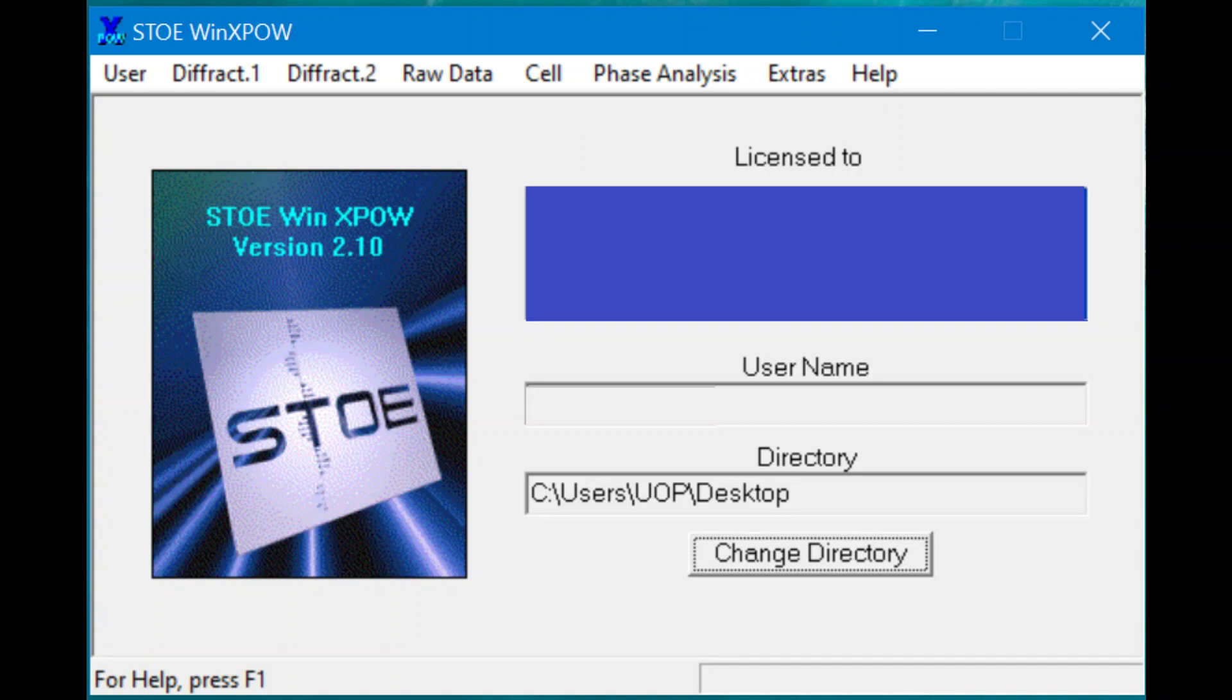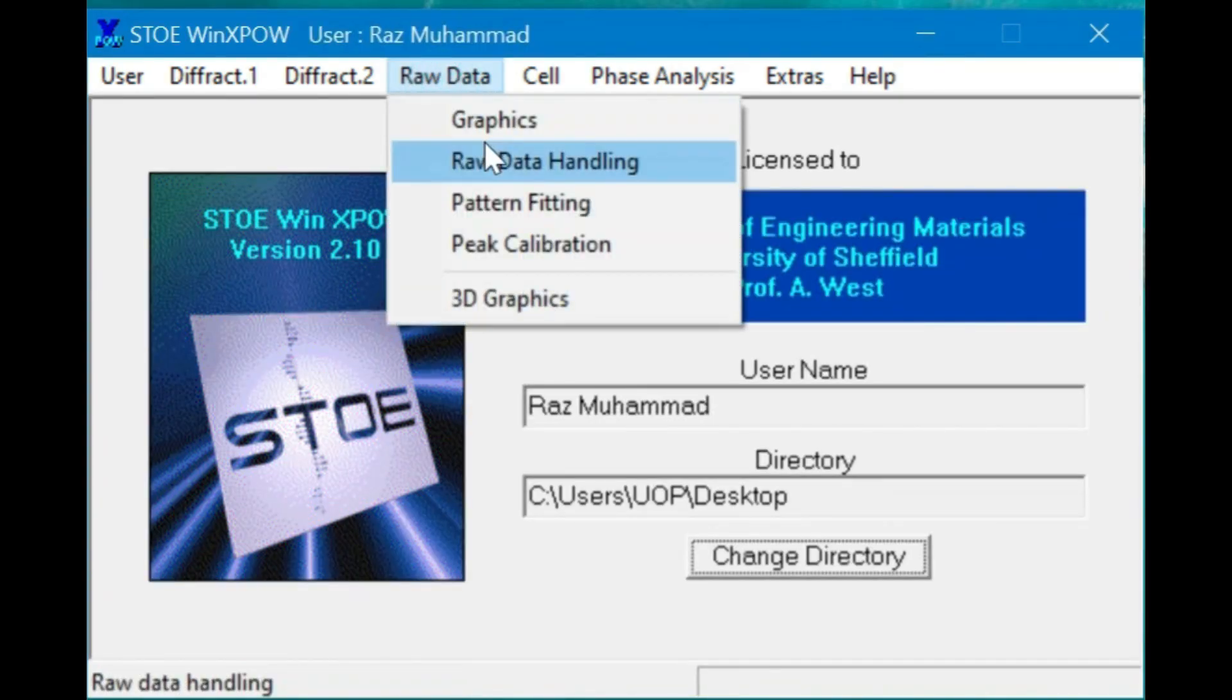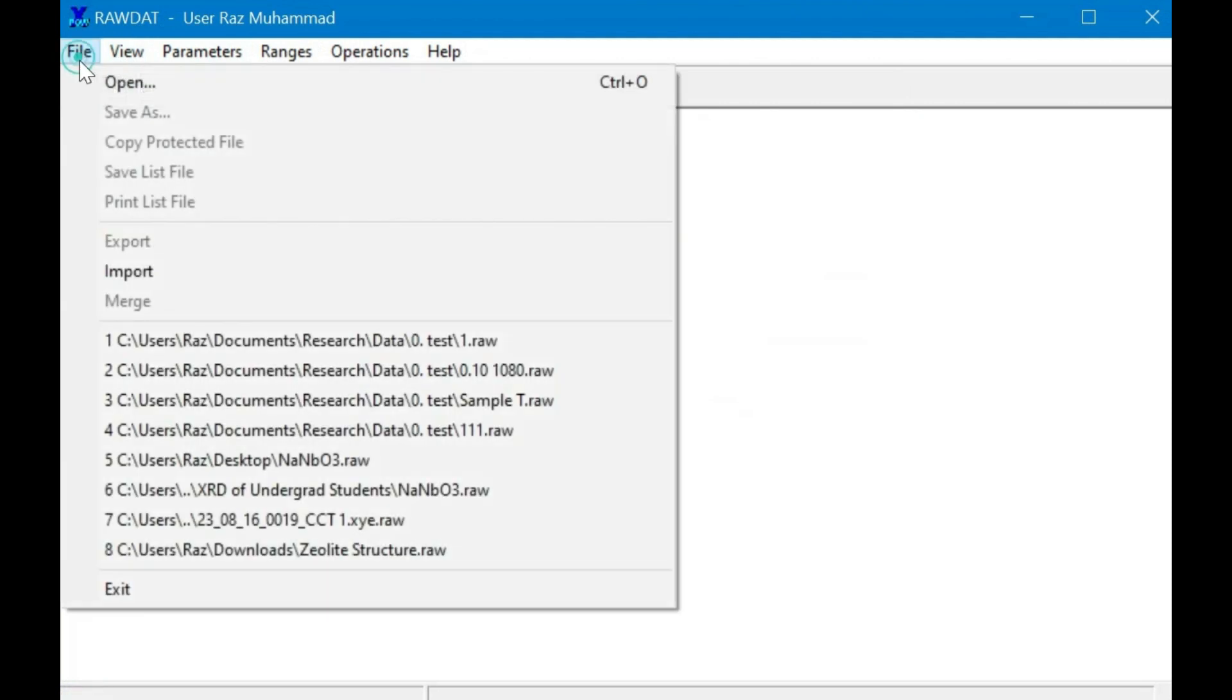Hi everyone, today I will guide you through using the WinExpo software for phase identification and more. You need to begin with two-column XRD data with one column for two theta values and the other for intensity.